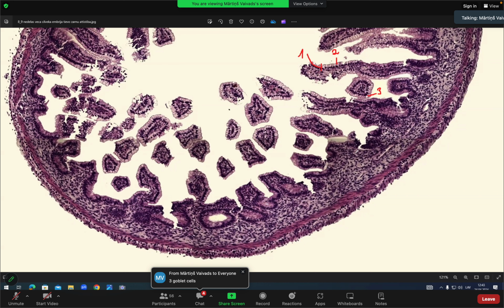Then what's unique here? You can see the connective tissue. Technically it's mesenchyme, but what's special here? In the intestine during these 8-9 weeks of development, the mucosa is still connected to the submucosa. So we use the term connective tissue of the mucosa and the submucosa.